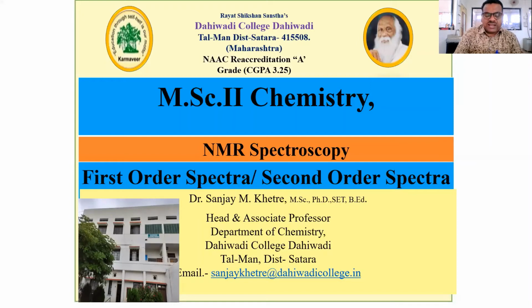This presentation, we try to finish that presentation and then we will stop. Now see here, first order spectra and second order spectra. You can also have a third order spectra, fourth order spectra and so on. But we are not going to see in detail fourth, fifth and complex spectra.